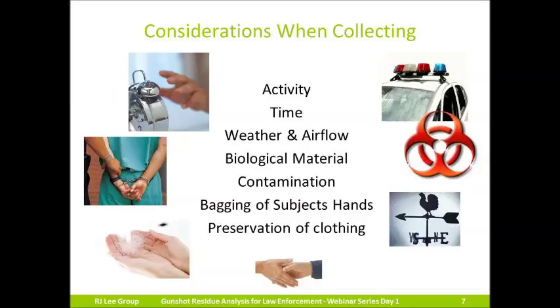It may also be important to note a subject's activities prior to the incident as well. For example, if a subject states that on the morning of the incident he or she went to the gun range or went hunting, then finding GSR on them wouldn't really be that unusual. At that point, GSR analysis may not be very useful or a viable option for you in this investigation.